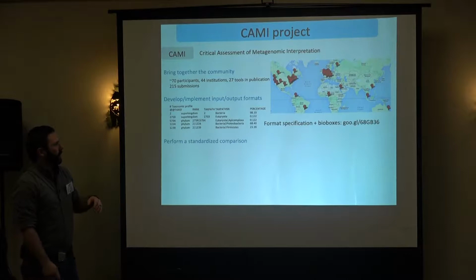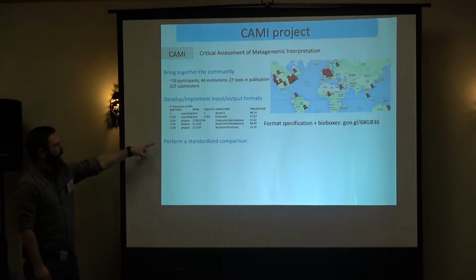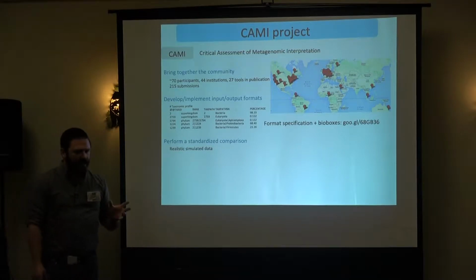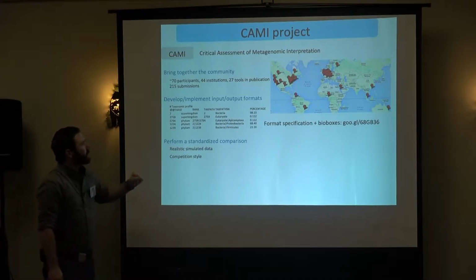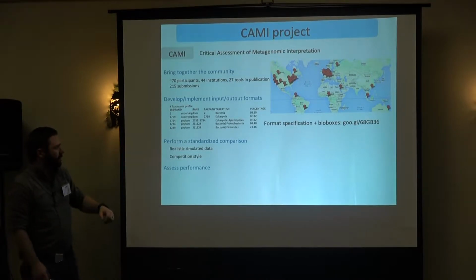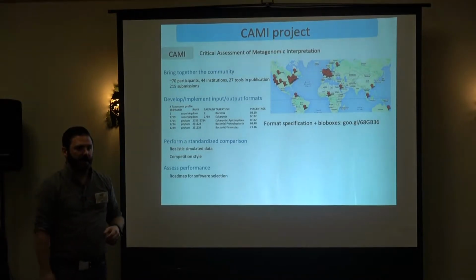Things you can look at if you want to, and perform the standardized comparison. We try to use realistic simulated data here, and people are competing to see who has the best tool, and really assess the performance of these things.